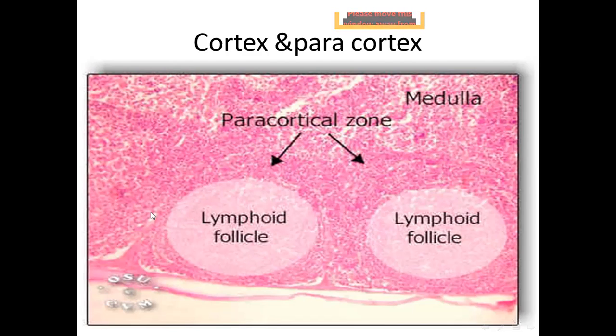So it's the direction and the peripheral site of the germinal center.